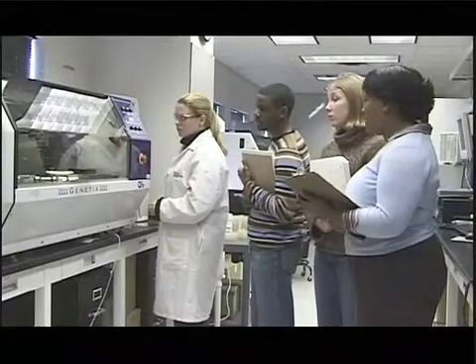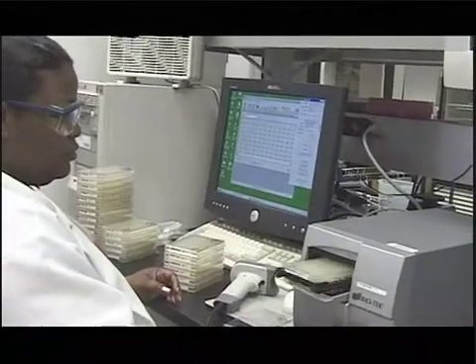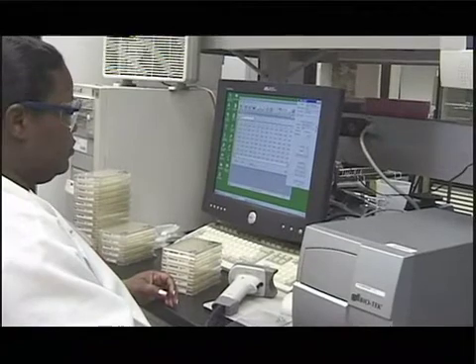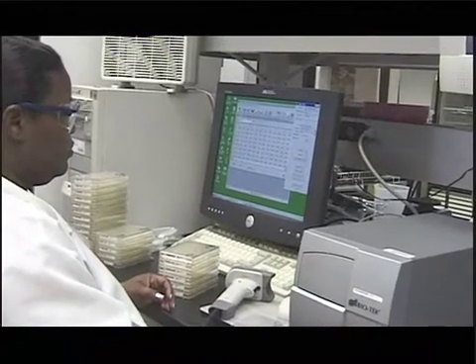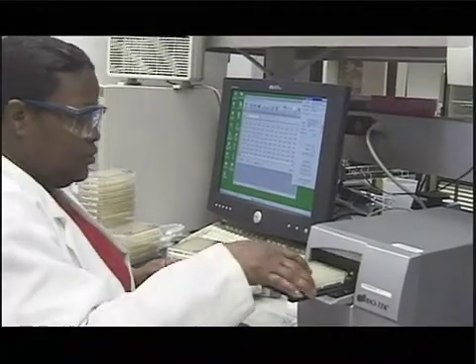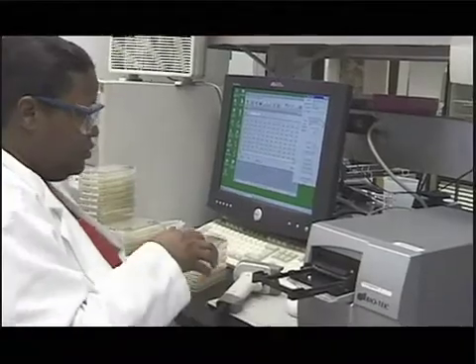So this robot is inoculating many liquid cultures? Exactly. After incubation overnight, the 384 well plates are brought to a spectrophotometer, which is a machine that sends a light through the bottom of the culture and checks for cell growth.